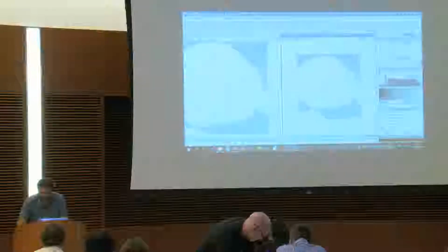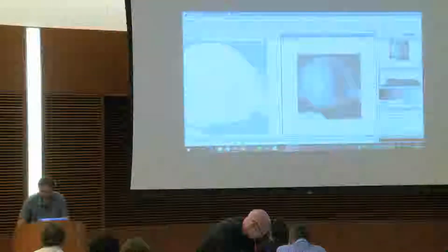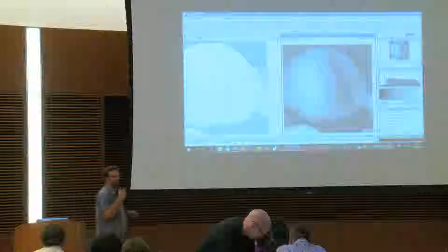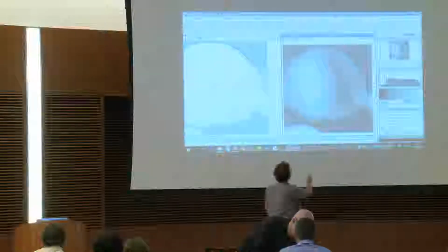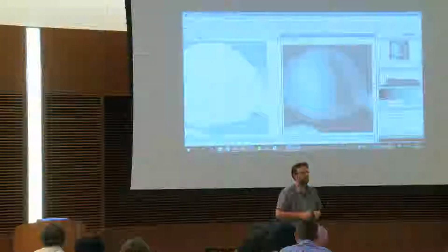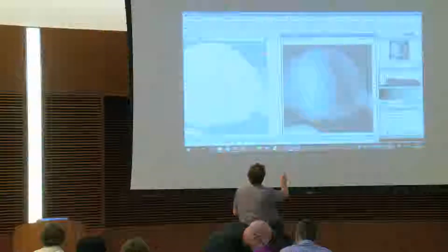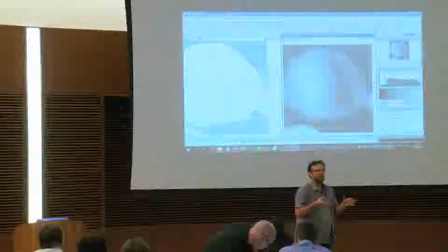you see it's cool to be able to have several viewers. You have an idea of the shape of this. So here it's going to be the top, and then here we have kind of a donut, I will say. So here we have those stripes. So I ask again, could you tell me why do we have those stripes?